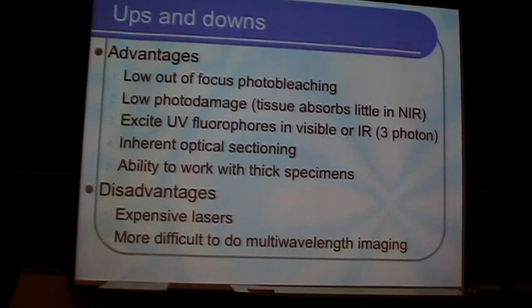The other advantage is that we do not need the pinhole in the case of two-photon fluorescence microscopy, since light is coming mostly from the focal point in the sample anyway. And it's also possible to excite UV and visible dyes by using visible or near-infrared laser beams through the 3-photon or 2-photon fluorescence processes.